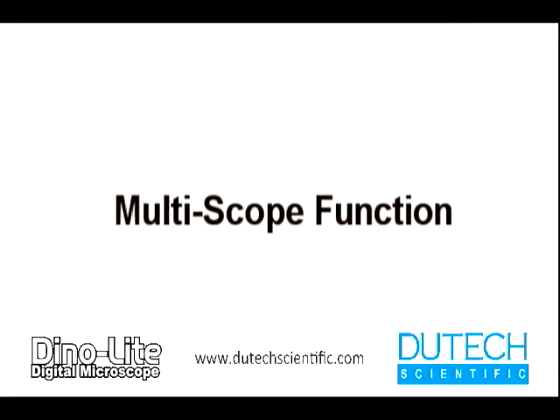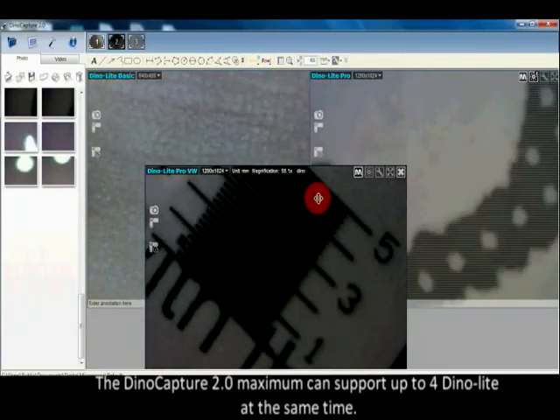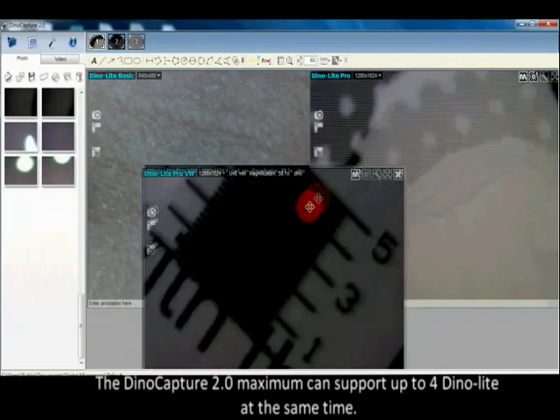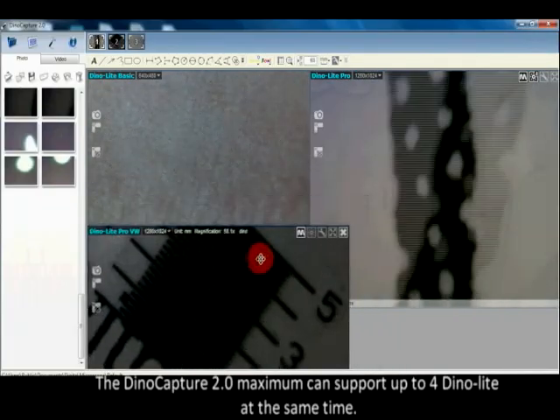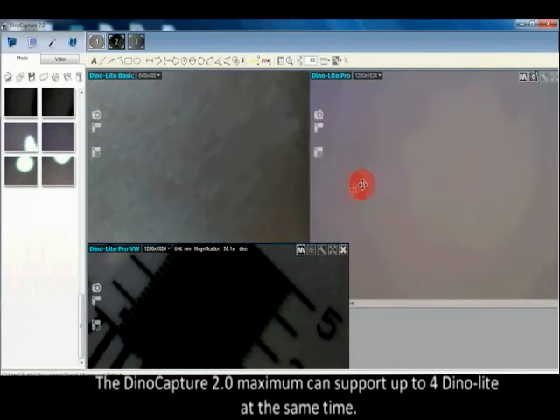Multi-scope function: The DinoCapture 2.0 maximum can support up to 4 DinoLite devices at the same time.